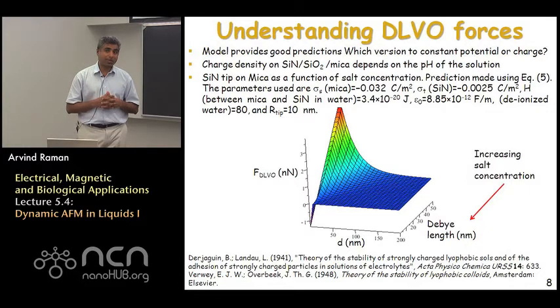And that is one of the challenges that comes into applying the theory, that it's very, very rarely the case that you know exactly which boundary condition you need to apply, unless you've taken a lot of effort to make sure that the two surfaces are conducting, and you know there is no contamination on that, and that you can apply known potentials, for example. So that's one challenge that comes up.